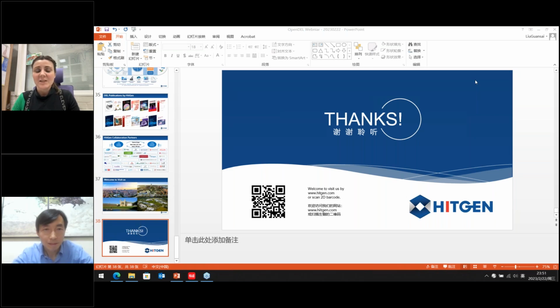Using these technologies you mentioned in your article and paper, can we take an RNA target and actually do this DEL screen with OpenDEL, or do we need some specific library? So in theory, it's possible, but probably we don't suggest that because without the experience, it's hard to do the RNA target selections.